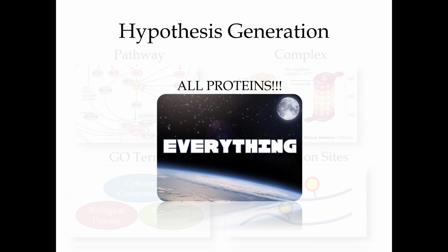And then some people say, well, I just want to measure all proteins. And that's definitely possible, and the tools are getting better and better for that, but that's a much harder thing. We're going to get into how you can do it. But even when we're doing it, we typically will start with some DDA data to narrow things down. So we won't just take a FASTA file and say, hey, let's look at everything.